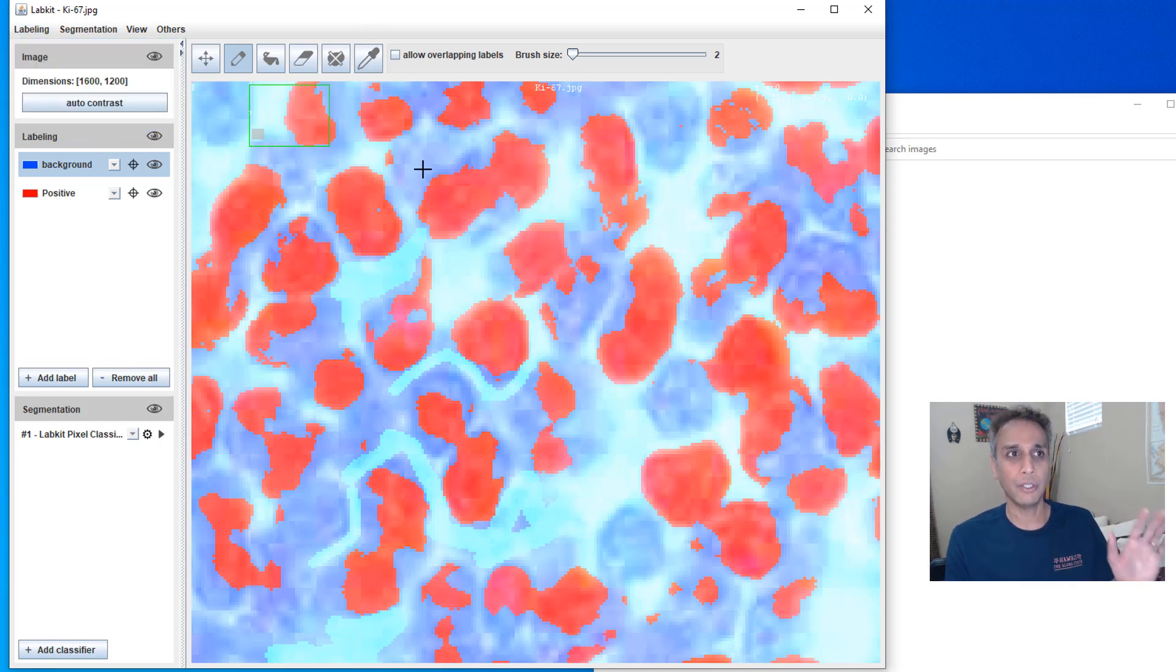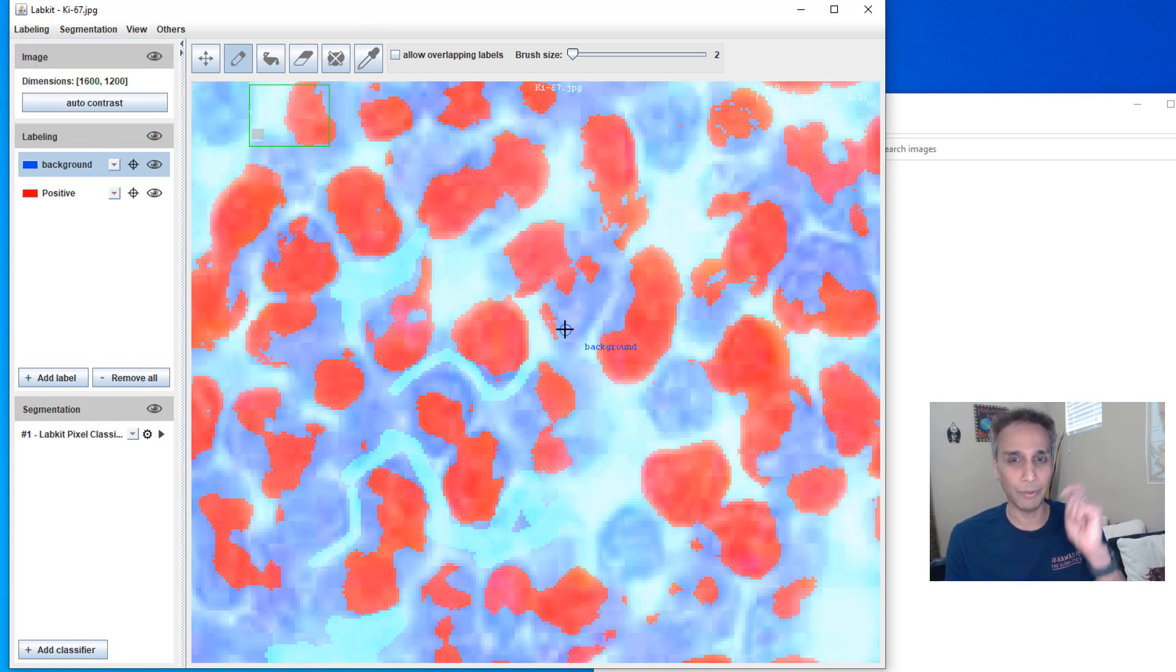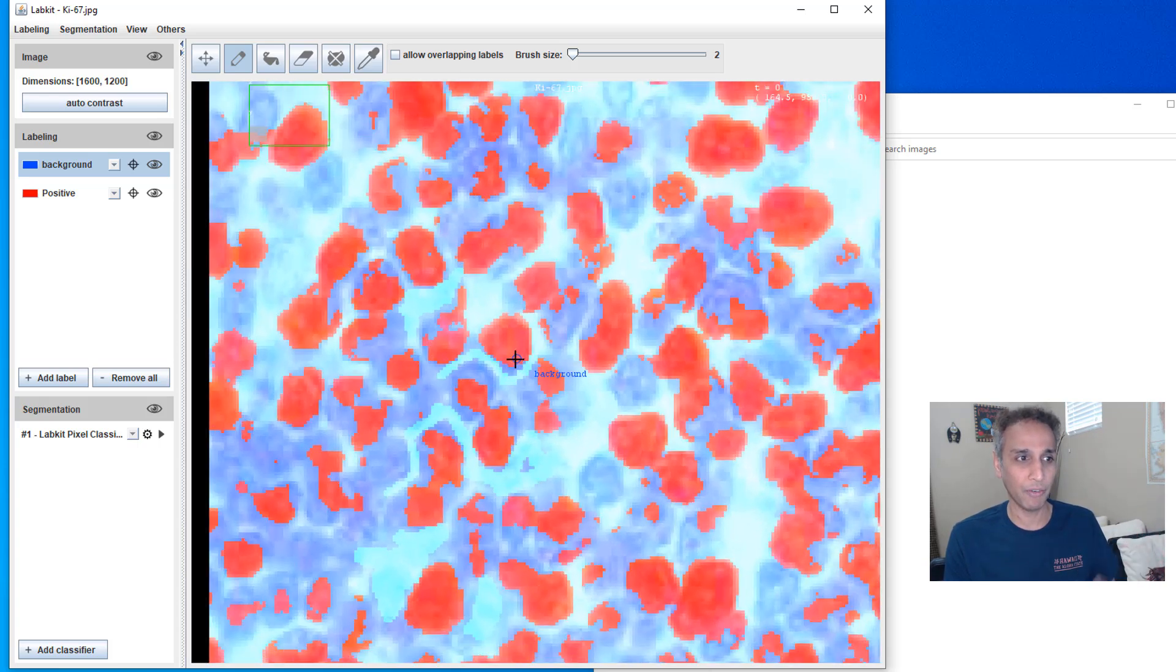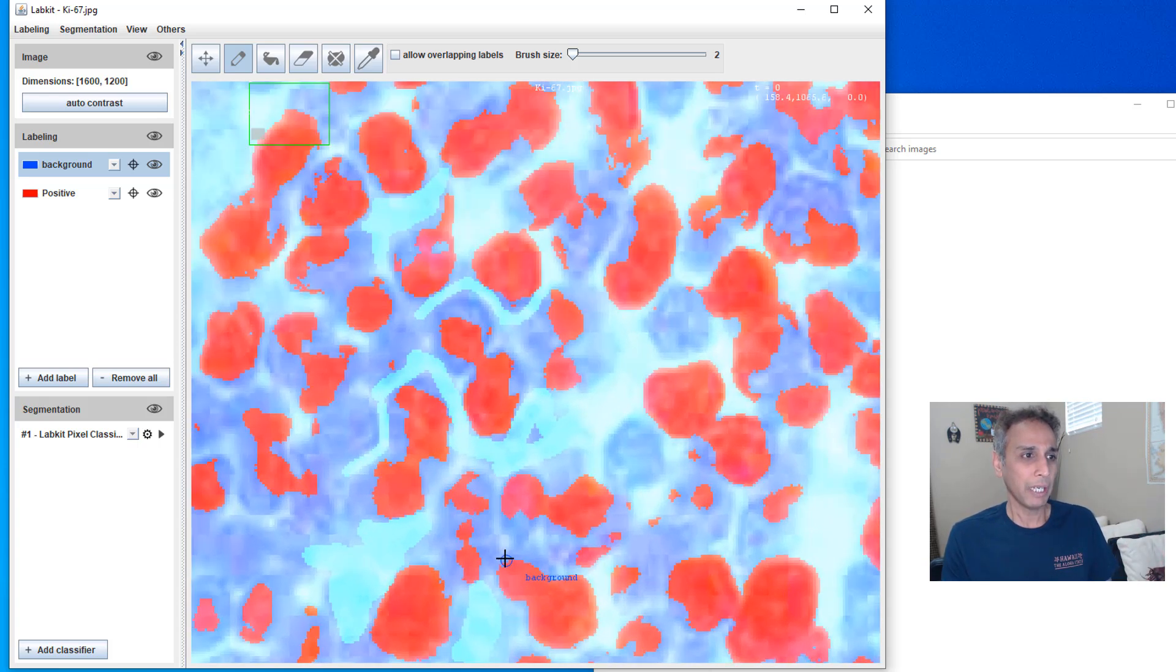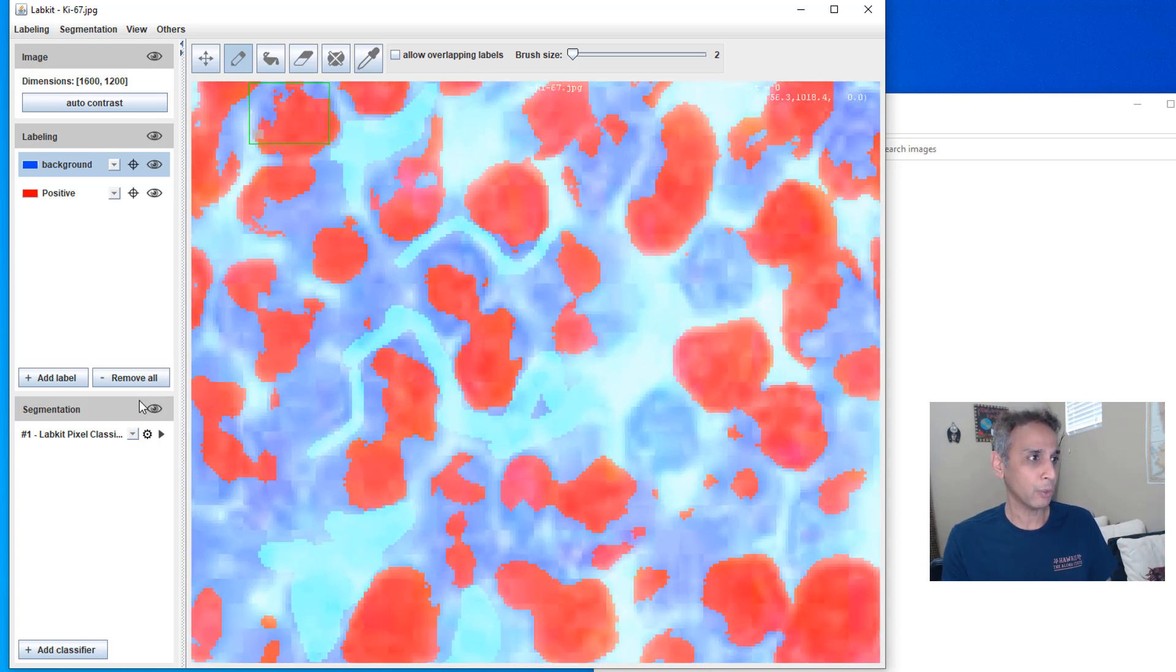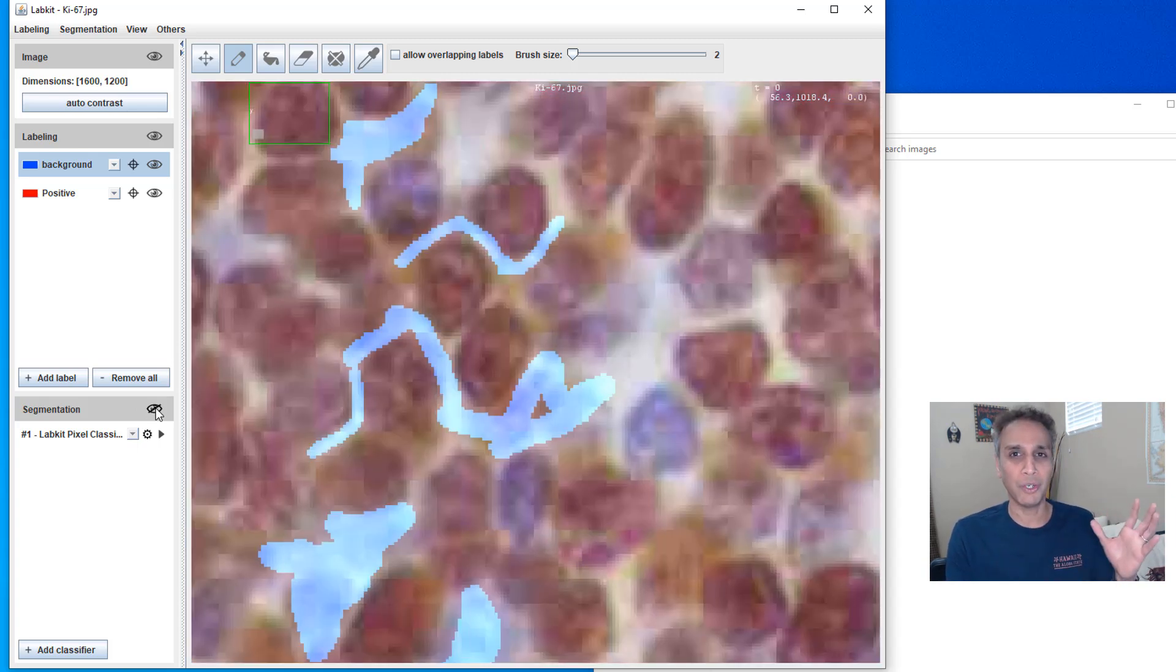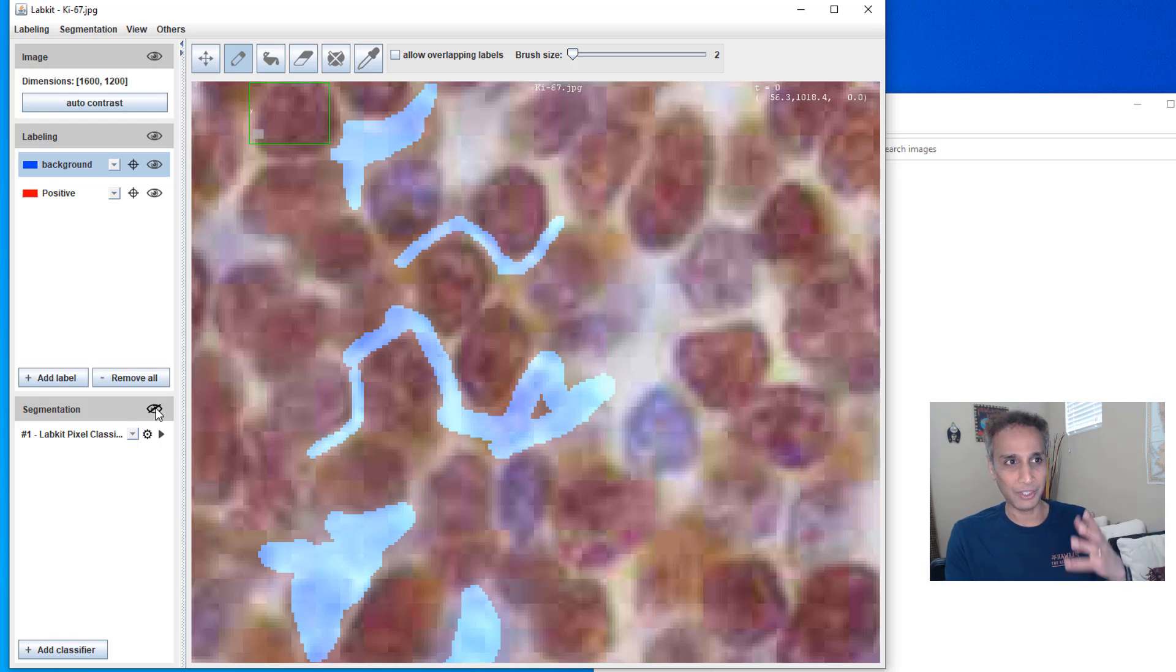Just go ahead and go export selected labels as bitmap. You're done. You paint every pixel. You do your, you know, and go to export and go ahead and export. You're done right there.